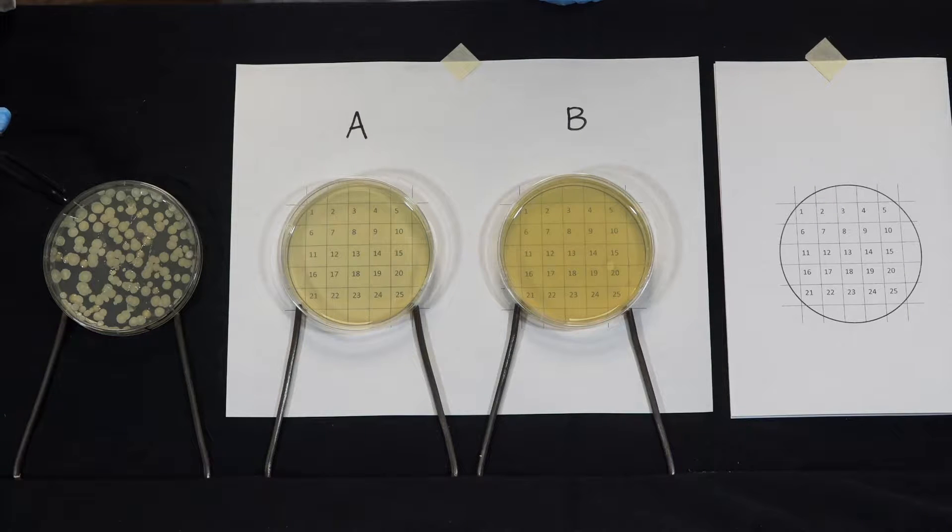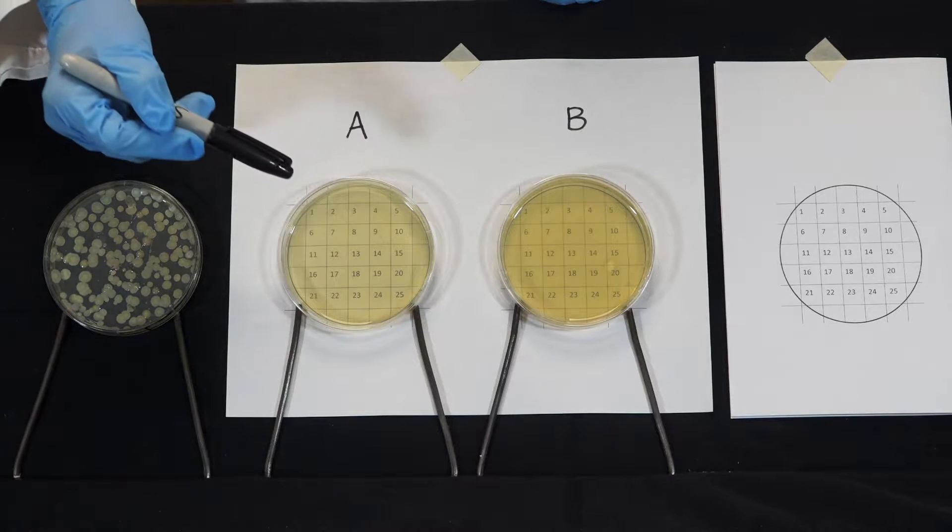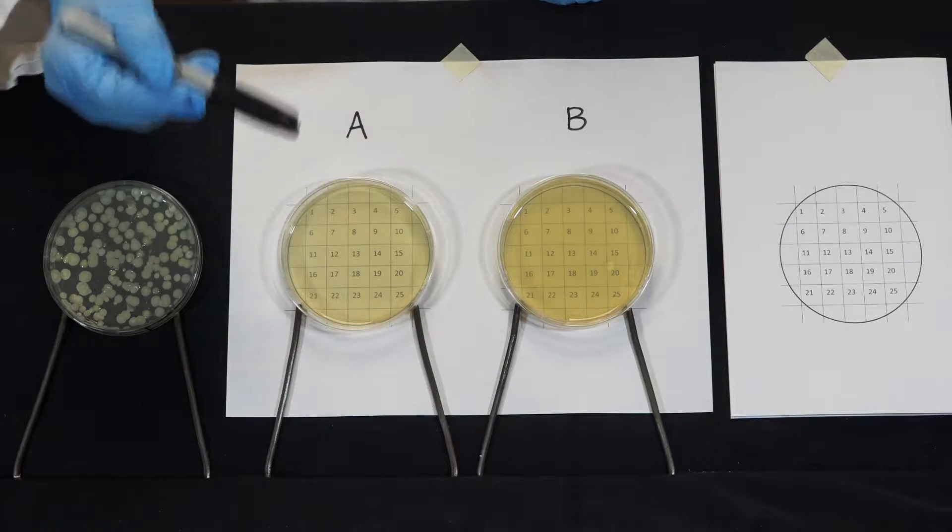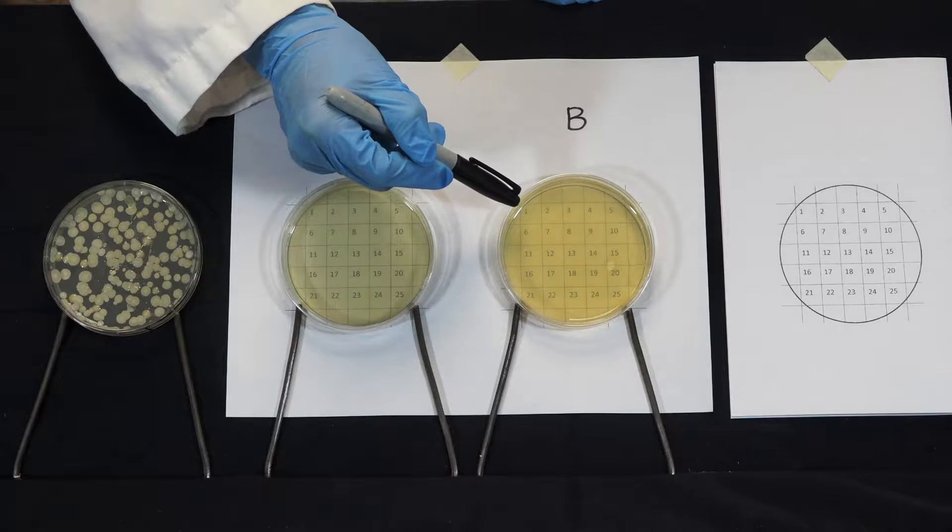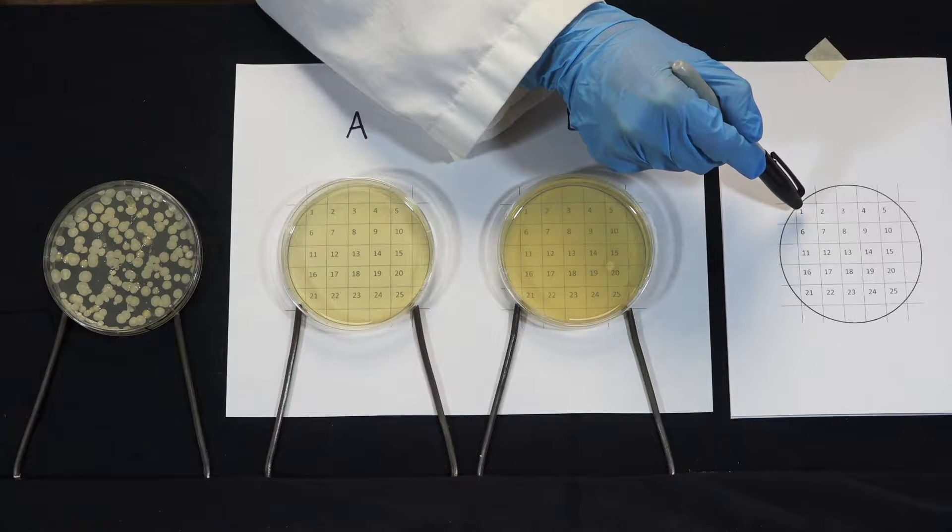We're going to pick a colony from this plate and inoculate square one on plate A and square one on plate B. Then we'll mark off that we've inoculated square one.